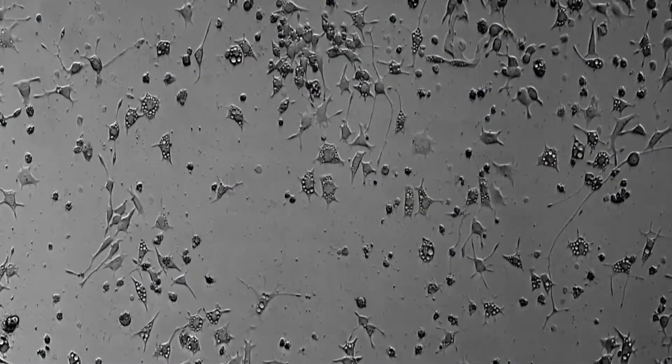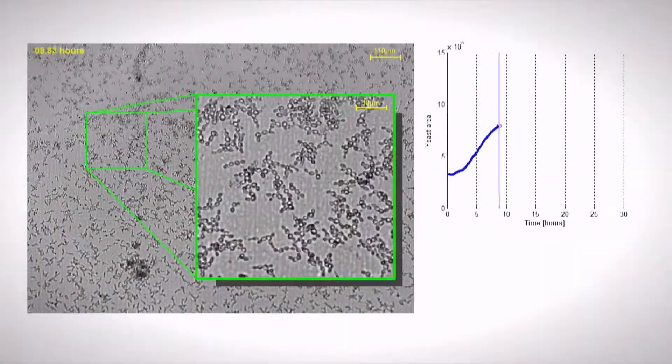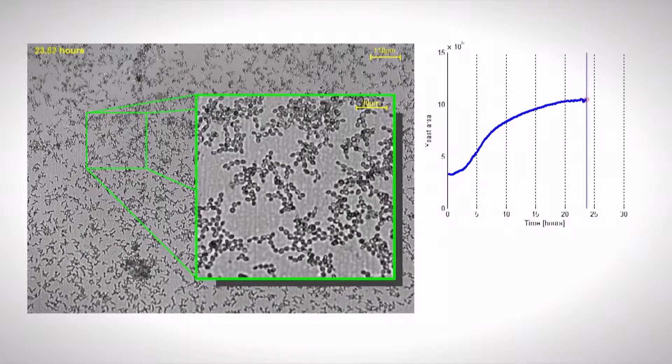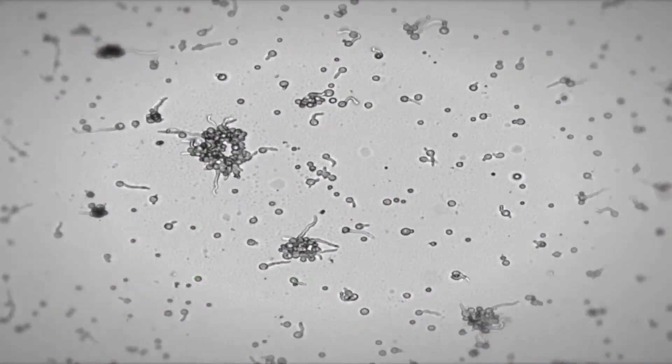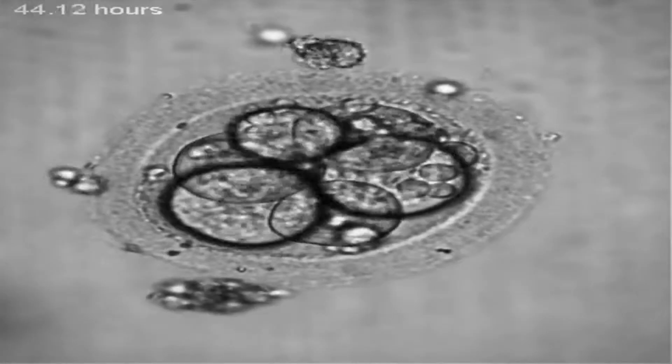Almost all types of microorganisms can be detected and monitored in samples, including bacteria, cells, algae, fungi, yeast, and embryos.